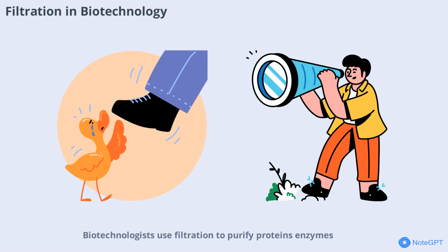Biotechnologists use filtration to purify proteins, enzymes, and other biomolecules. Filters with specific pore sizes can separate molecules based on size, charge, or affinity. This technique is essential for producing high-purity products used in medicine, research, and industry.